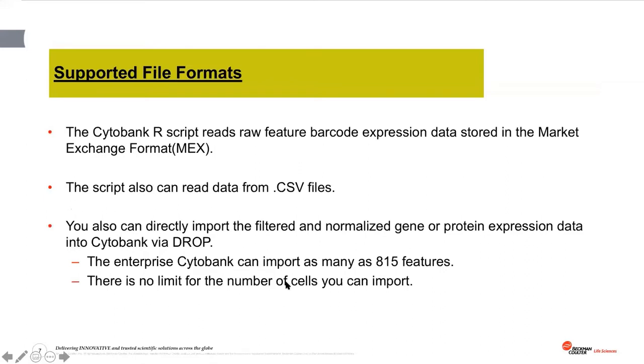And specifically, I would like to mention that in step 2, we provide a Cytobank R script. Again, if you can get help from bioinformaticians, and they probably have their own customized script, you can trust them and let them do the filtering or normalization for you. But if you are interested in doing step 2 yourself, and you are familiar with R programming, you can download the Cytobank R script and use the script to process your raw expression data.